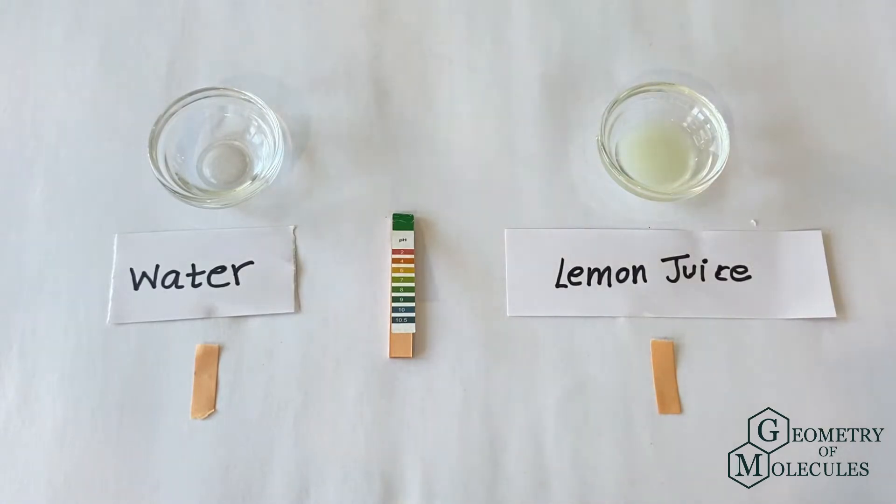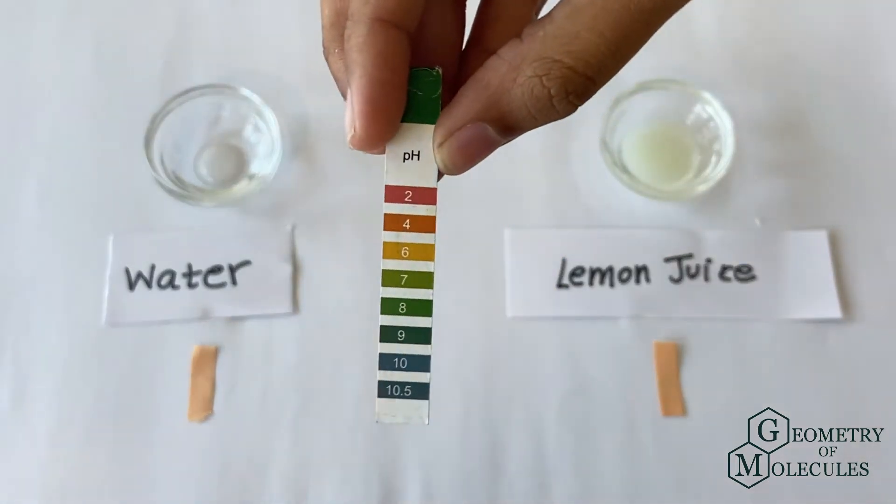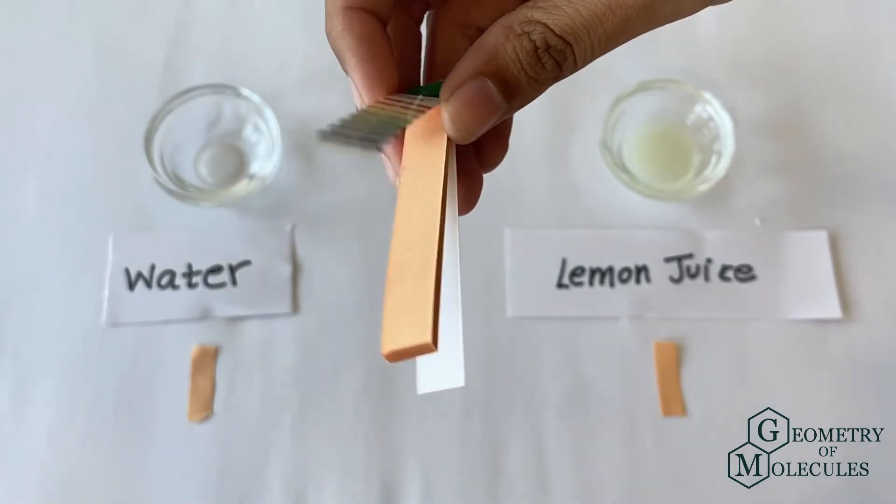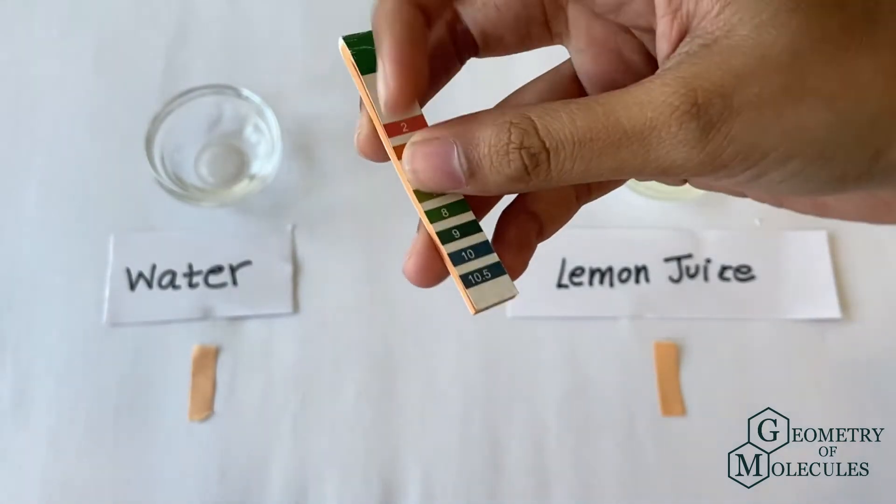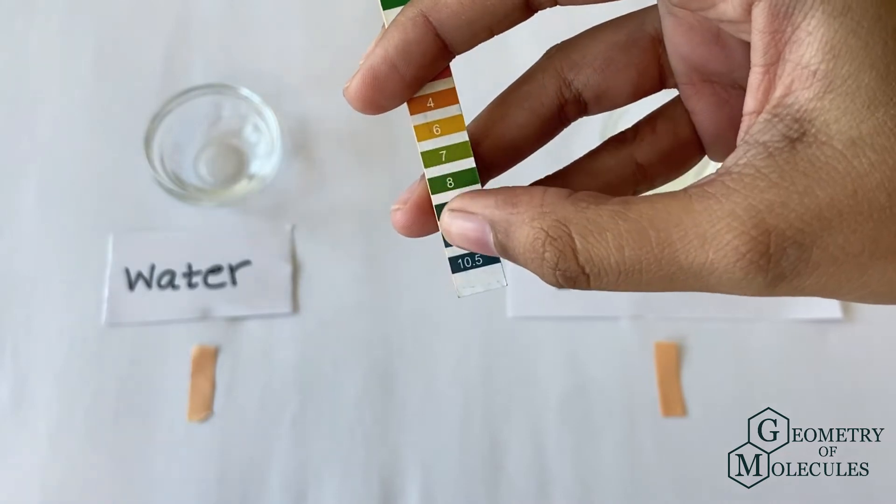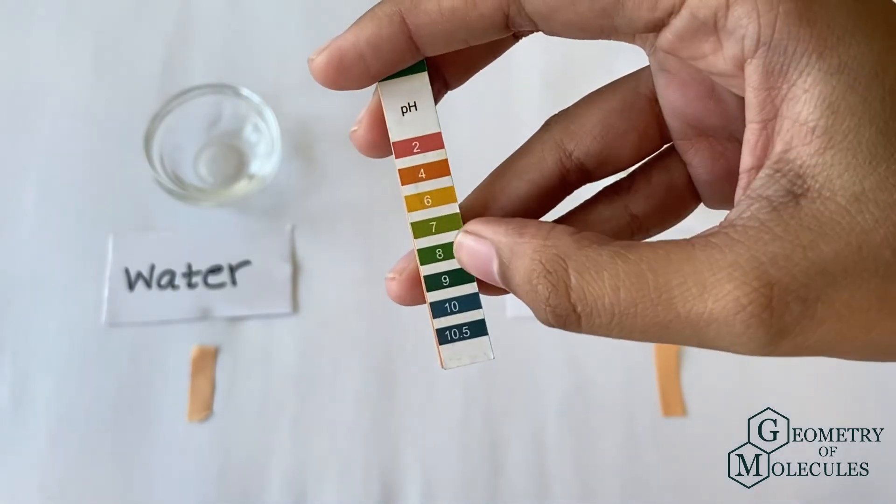This is what a pH strip looks like, and based on the nature of our sample, the strip will change its color. Substances over 7 pH are considered basic, while the ones under 7 are considered acidic.